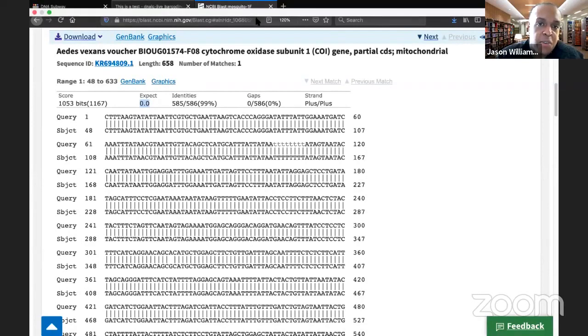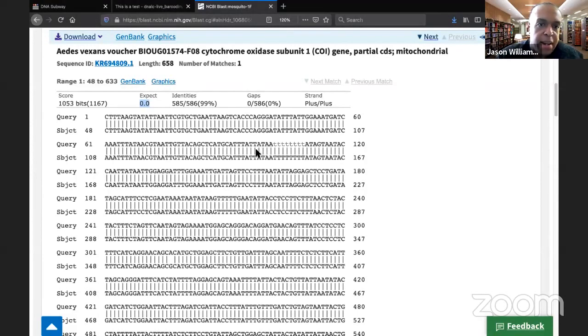Okay, let's go back to our slides and we'll discuss this a little bit more. We'll do the BLAST search in Subway and then we'll talk about what's coming up next time. So let's go back to my slides.